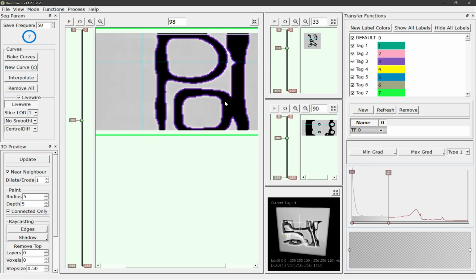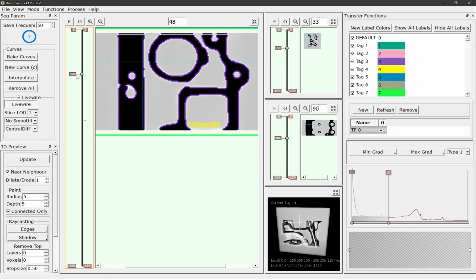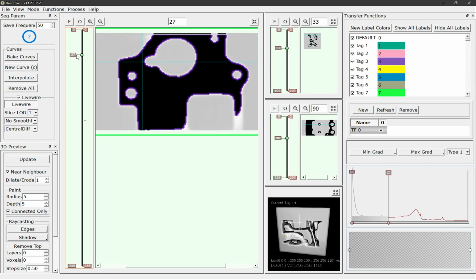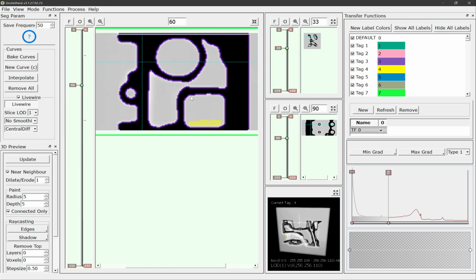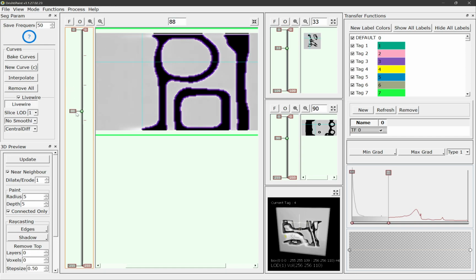and then you can see the style of the image changes. So let's add a point. You left click to add a point, and then spacebar to complete it. And then go all the way out here. And then again add a point. Complete it using spacebar and completing this curve. Say in the middle here, click, spacebar to complete it.